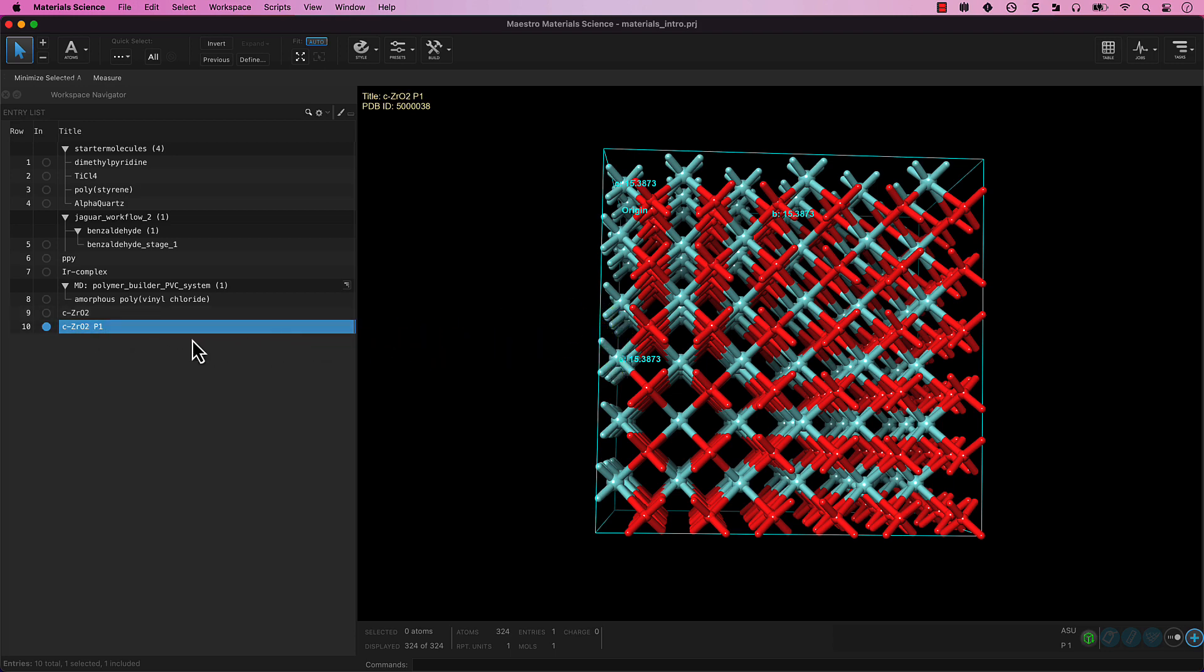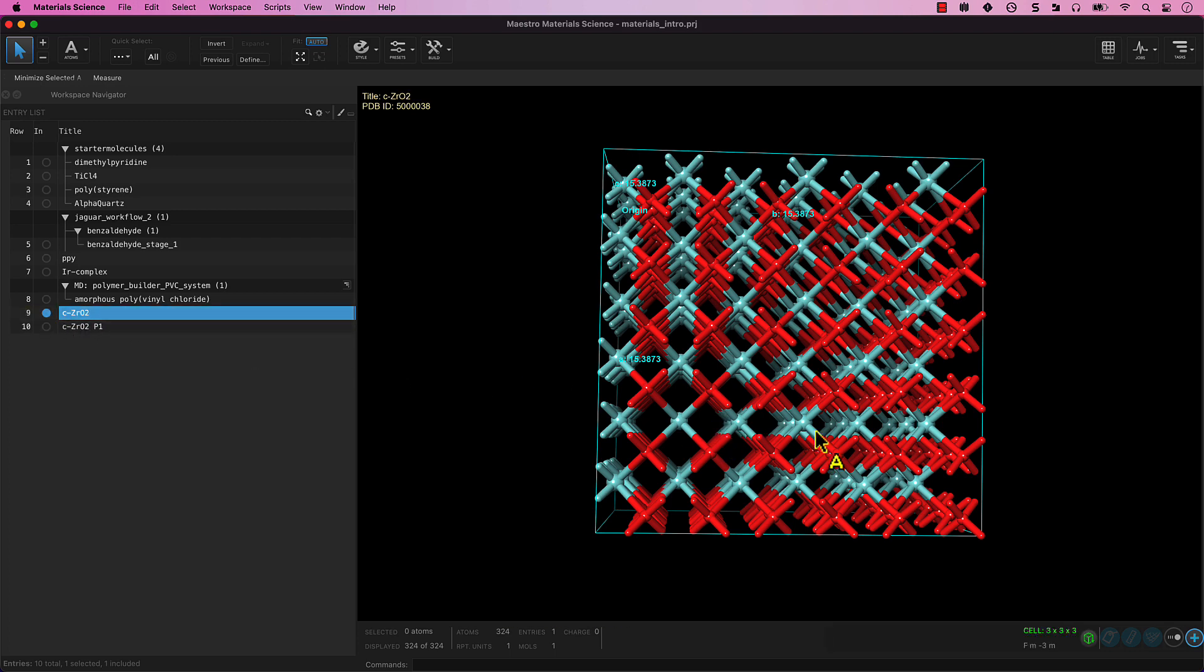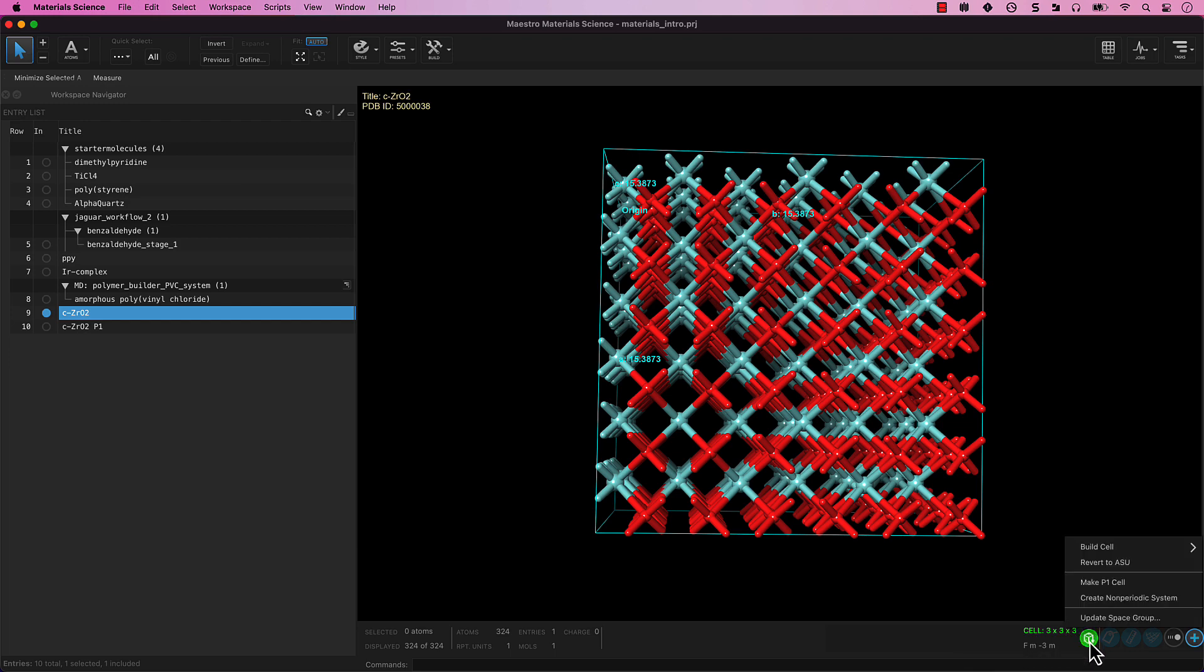Suppose we wish to reverse the original entry back to the asymmetric unit. Include C-ZRO2. Return to the Periodic Structure Tools and choose Revert to ASU.